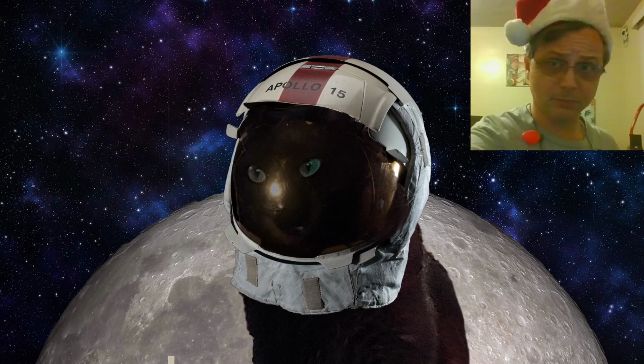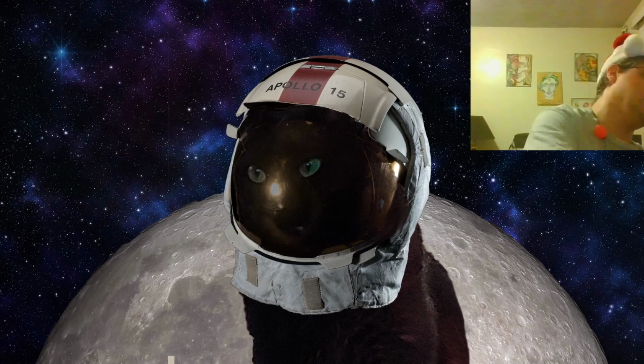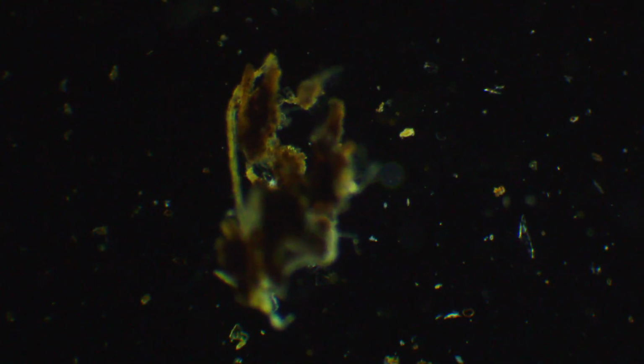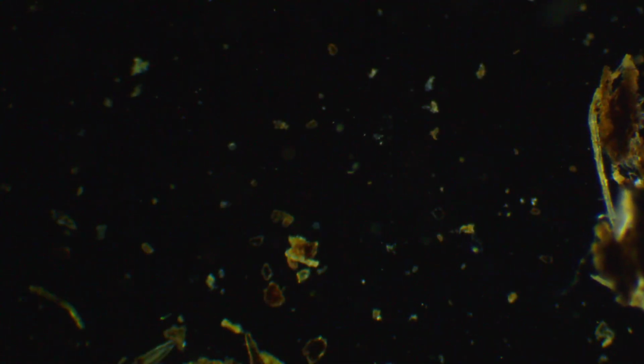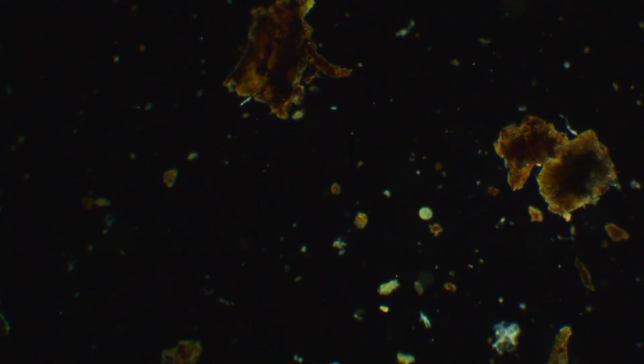Let's see what we got. I'm gonna put the slide on the stage. Try not to blind myself. And try not to spill. Drop, slide it into position, go up to the top, and let's see what we got. There's some material. Let's go over here.